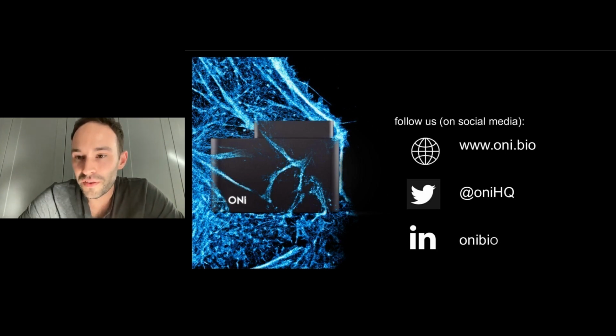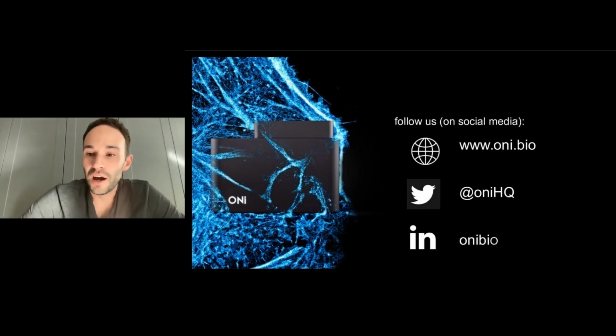And then the question here, what about EVs? Sorry, so maybe that was in the context of EVs. Again, it's a difficult challenge with EVs is how you capture them. So in principle, yeah, you could use our resources without the capture molecules. So if you have a particular capture method that you prefer, then that would be fine. You could use our material.